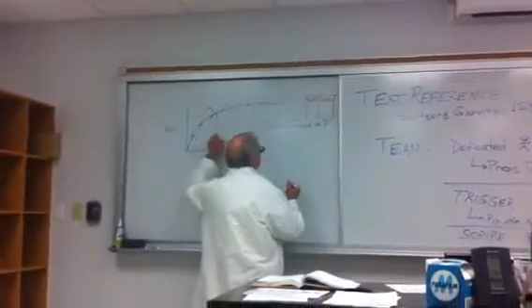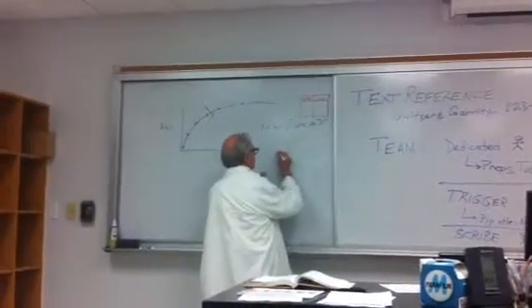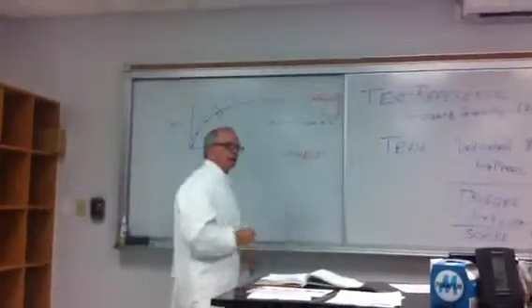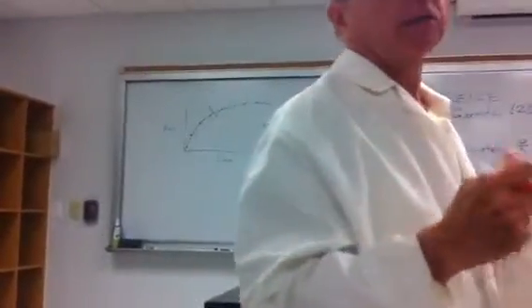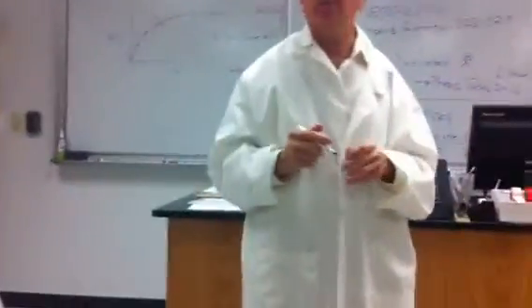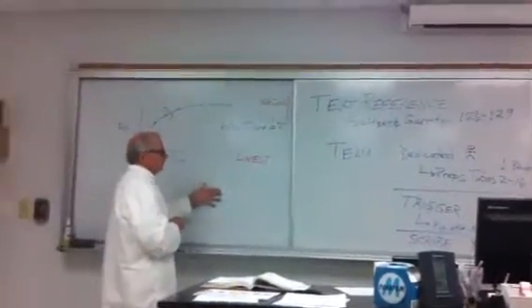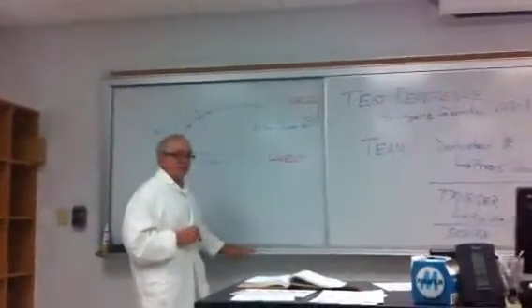There is a command. You can do it by plotting it, or you can command it. I believe that the command in Excel is called linest. You can open up my smart zones and look at it and say, what was that command called? I think it's called linest. But for each tube, you have to calculate a rate. That's my point. Tube 2 to 6, tube 7 to 11, and tubes 12 to 16, you have to calculate a rate.